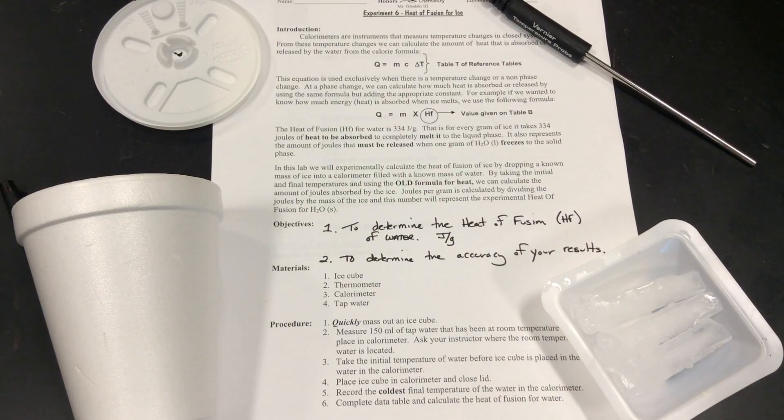This is the heat of fusion lab. What we're looking to do is measure the heat of fusion of water — how much energy does it take for a gram of an ice cube to completely melt? As we go from a solid to a liquid, we know it's an endothermic process. The ice needs energy to melt — that's why it makes our drinks colder.